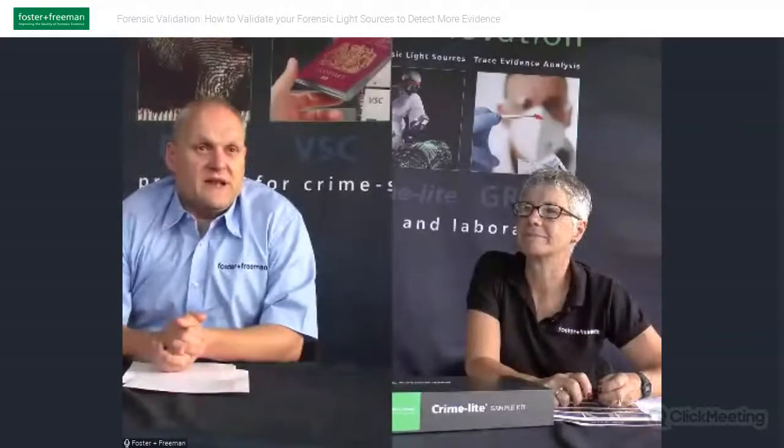Yeah, absolutely. If we go back 40 years, the light sources used to weigh about 80 kilograms. And today we're using handheld items that are less than a kilogram, and people often moan about the weight of that. But there have been such advances in technology over the last 40 years that if you were to show a crime scene examiner from 40 years ago what we use today, they just wouldn't believe it. It wouldn't have been possible.